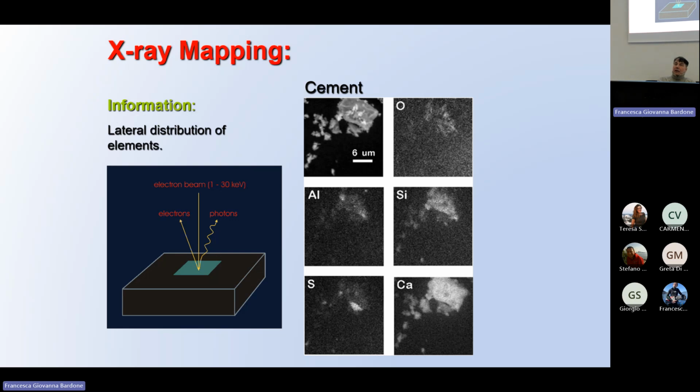If you ask me, okay, we do the experiment again, I use standards and I calibrate the intensity with standards, and then I can give you information about the chemistry in a quantitative way. But another thing is the spatial resolution of the chemistry, which is not the same as that of the morphology. So be careful, because I will show you later.